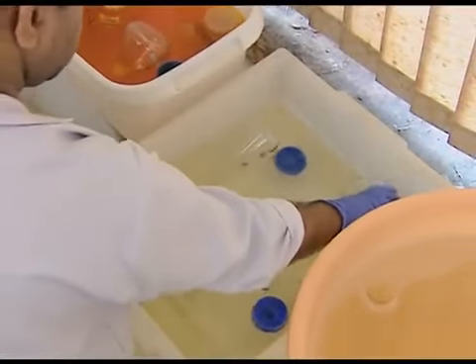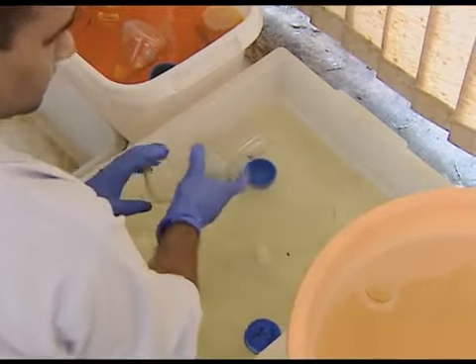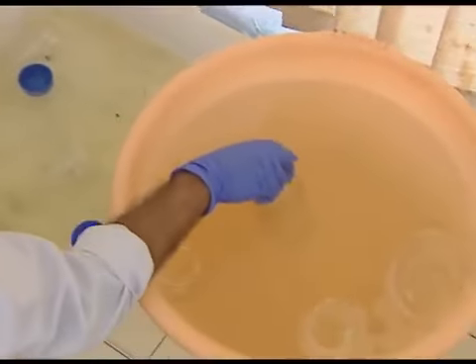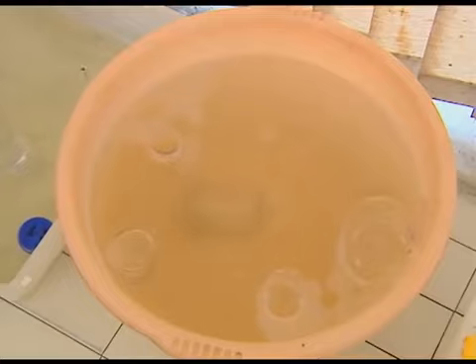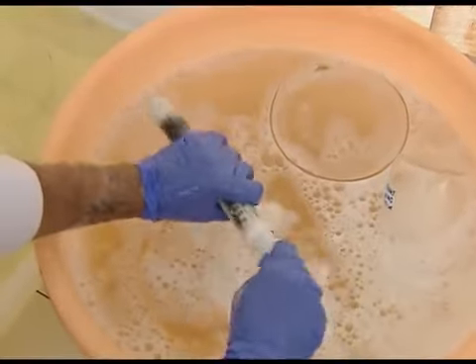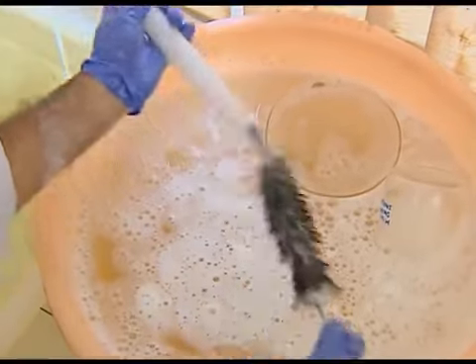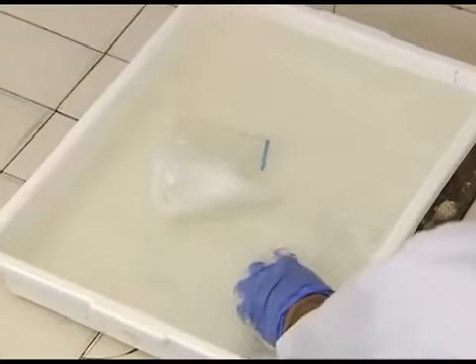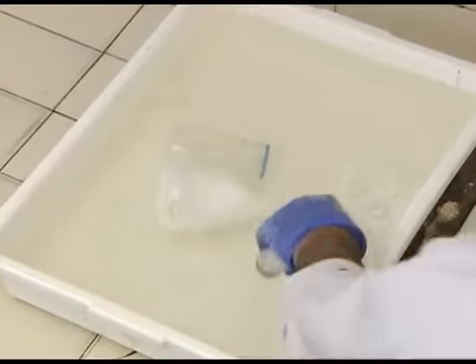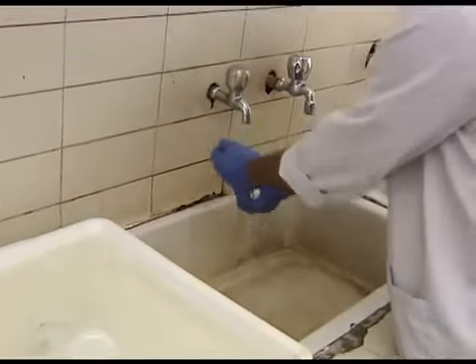After this, the glass and plasticwares are first rinsed with water to remove the chromic acid and then immersed in a tub full of detergent water and cleaned using hard nylon brushes. They are then immersed in another tub full of clean water, and the detergent is rinsed off.